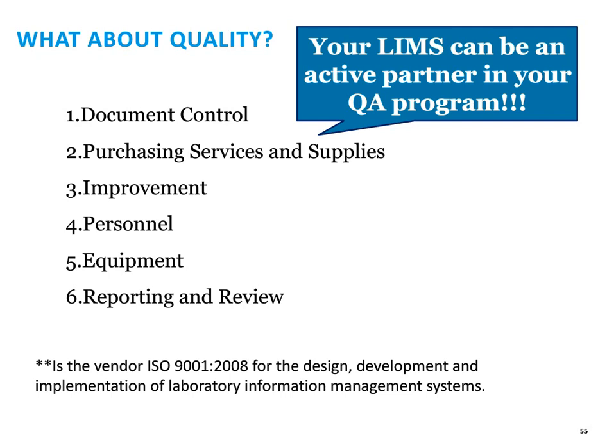For example, document control. If I can upload my training manuals and my SOPs into my LIMS and link them to the analyses, if I have a new examiner working in a unit, or maybe we've changed a procedure, and the analyst needs to view that SOP, why go to a separate system? Instead, while they're there conducting the analysis, it would be great if they could just click a button and view that SOP already stored within the LIMS.